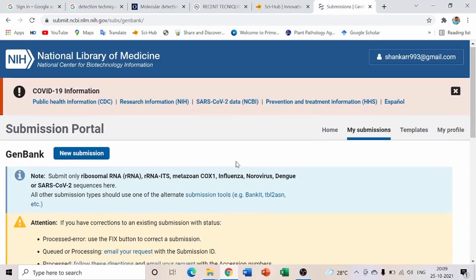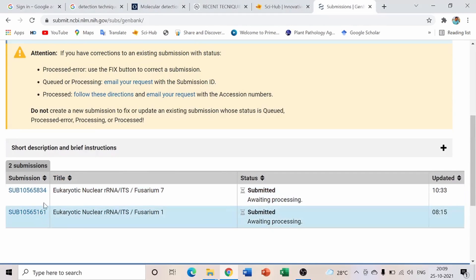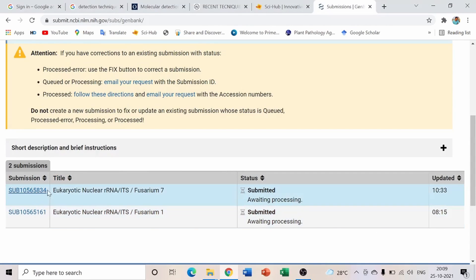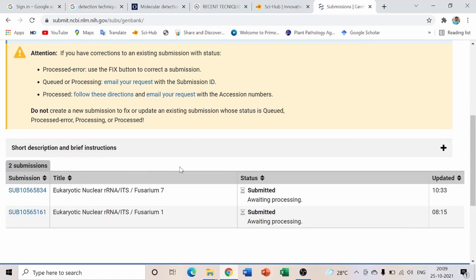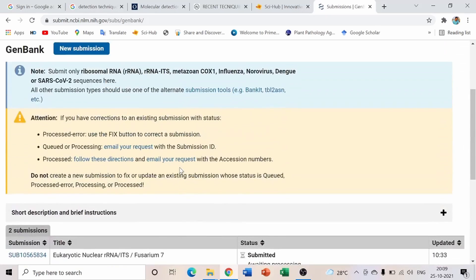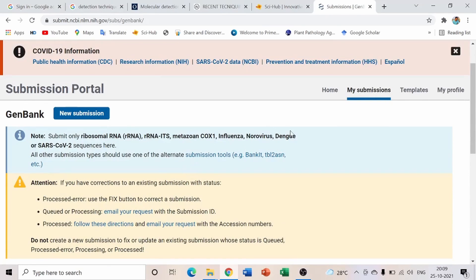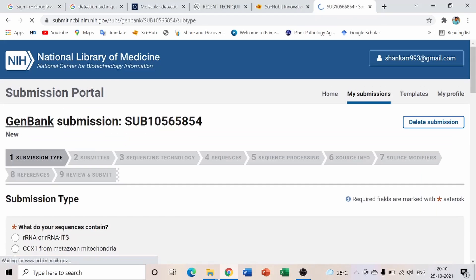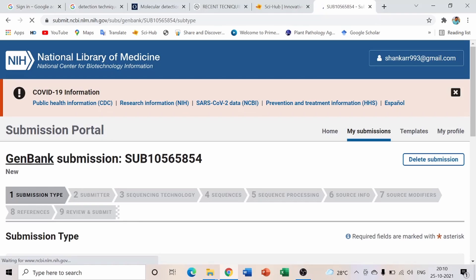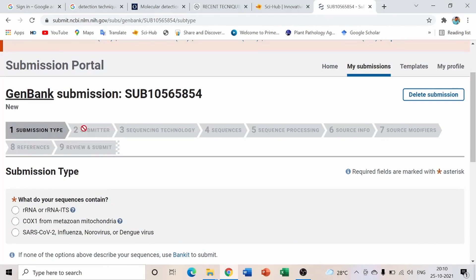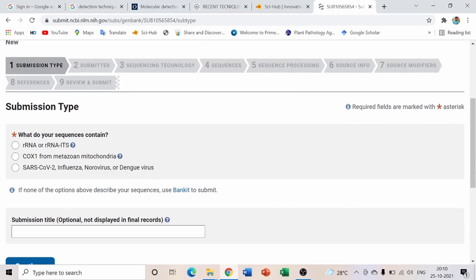Scroll down and click the blue Submit button. A new page opens showing previously submitted data. Click 'New Submission' to begin. A GenBank submission number will be assigned, and you'll see multiple steps: submission type, submitter, sequences, and so on — fill them up one by one.